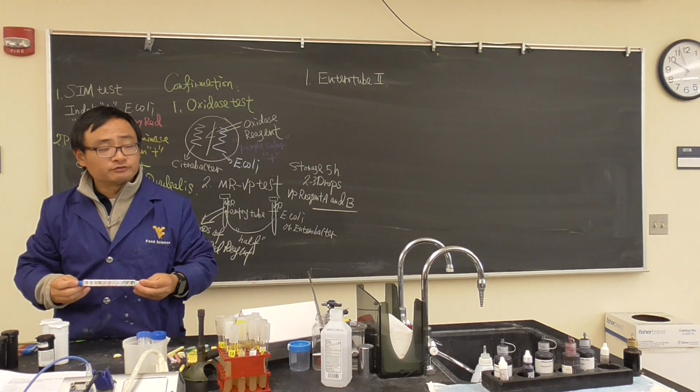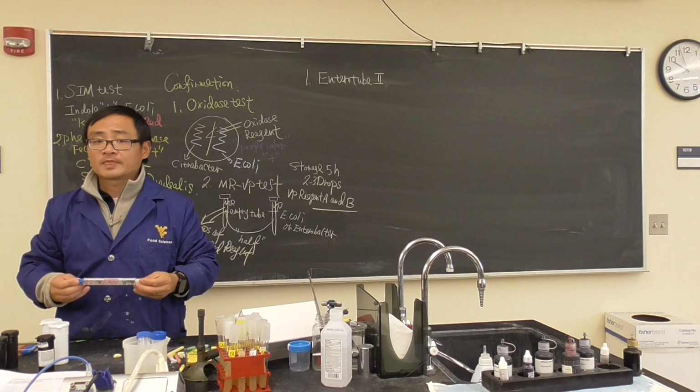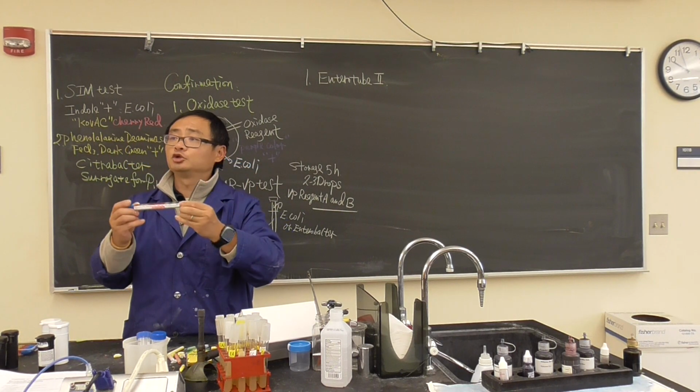We do all these biochemistry tests one by one, reagent by reagent. It's tedious, lots of work. So we have this tool, which is really nice, that has 12 biochemistry tests that can be done at a time.